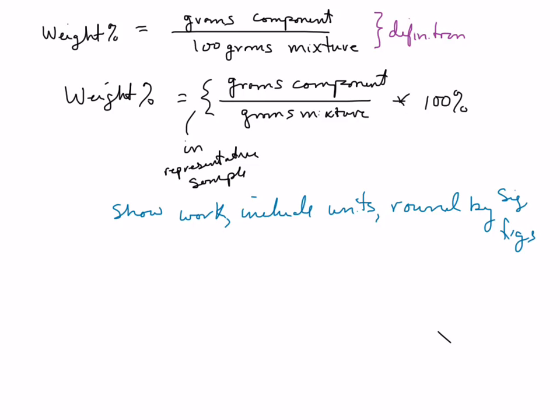So do you want to tare it before you put the component in the container, or tare it before and then put both of them together in there? The latter. The only time you're going to tare it with the container on there is to weigh your whole egg. Very good.